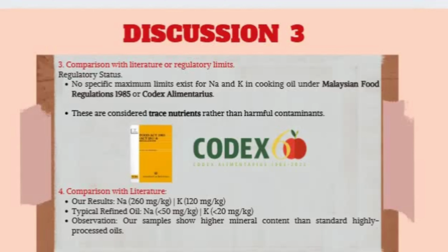Other comparison with literature is that based on our results, we got 260 milligrams per kg for sodium and 120 milligrams per kg for potassium. Typical refined oils are usually below 50 milligrams per kg for sodium and 20 milligrams per kg for potassium. So the observation here is our samples show higher mineral content than standard highly processed oils. That's all for discussion 3. Thank you.